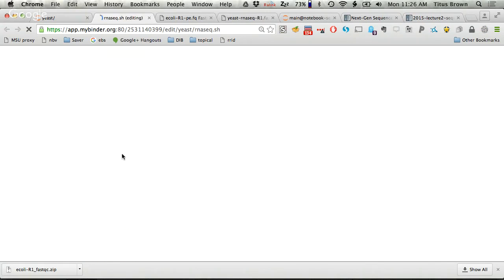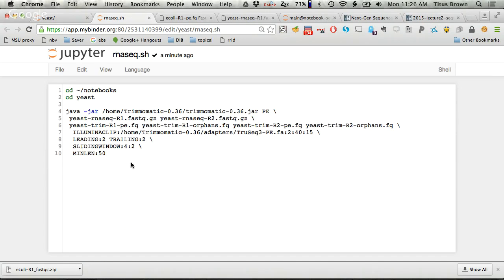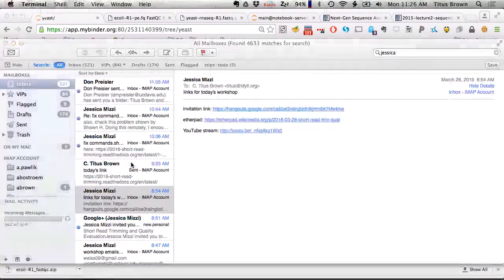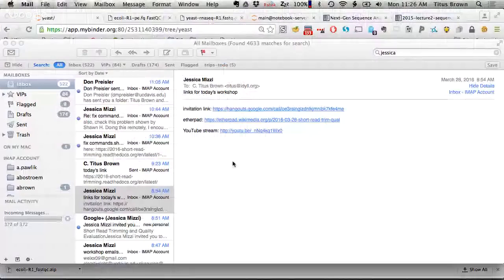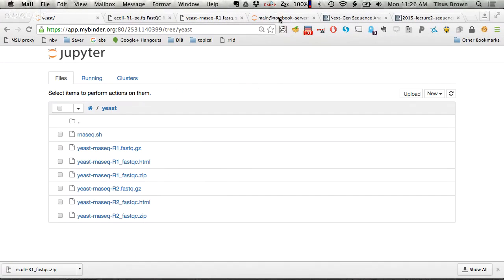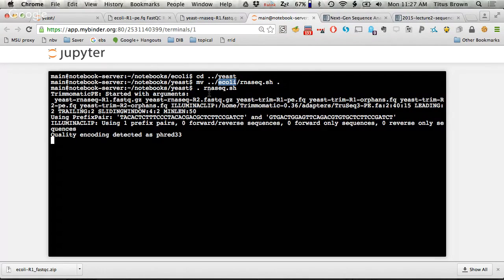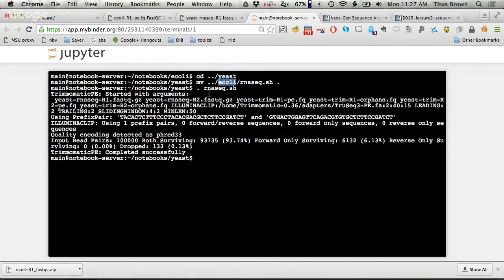What I'm going to do is, actually, I still don't have my Etherpad up. Okay, you put it in Etherpad, thank you. Okay. So, what just happened? No, that's right. And now I'm going to run it. You can run the command by copying and pasting it, or putting it in the command sheet, or whatever.